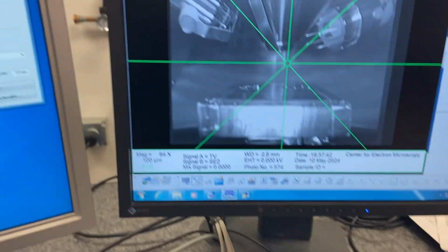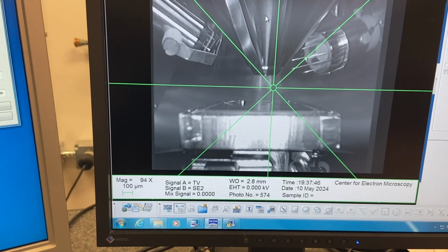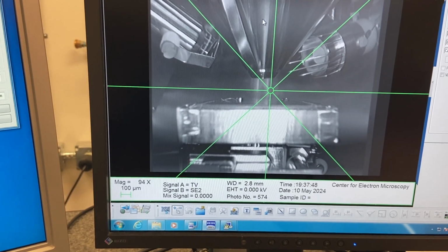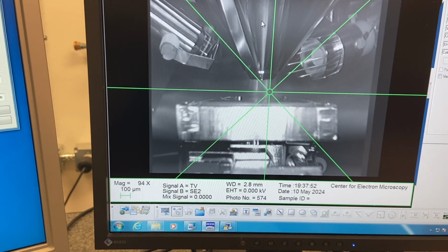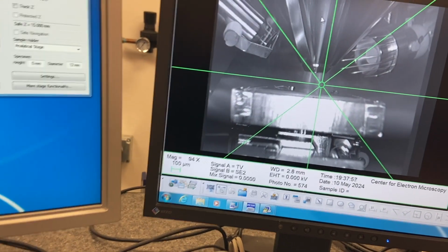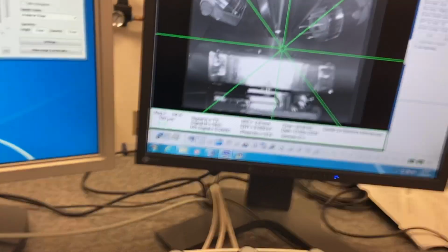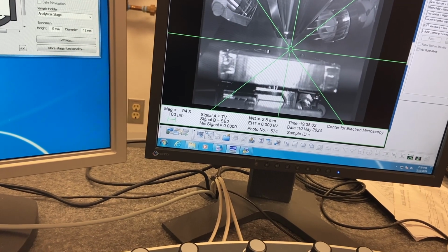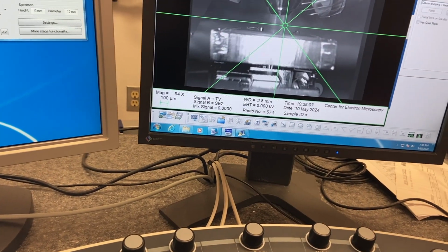Or you can just change this knob right here called focus, but I try not to touch the knob because I want to keep it at exactly 8.5. But if I do need to do fine-tune focuses, I'll do that. All right, 1 second. Sometimes you have to change this tilt control, so let me just put that at 0 and not have to worry about that. Perfect.